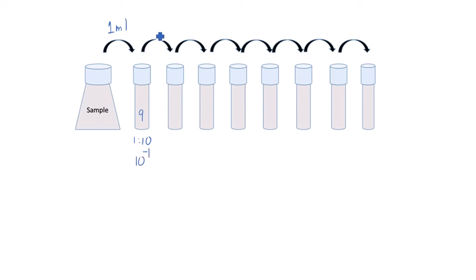But then you decide to use fewer tubes, and because you're using fewer tubes, you want to speed up the process. So you're using 1 ml from tube number 1 and adding it into 99 ml diluent in tube number 2. So now your total is 1 ml into a total of 100 ml. That is what you worked with in tube number 2.